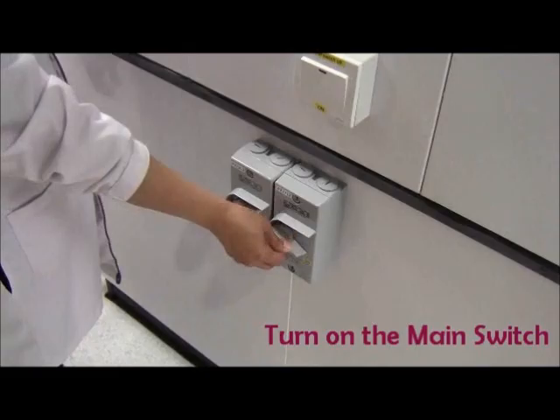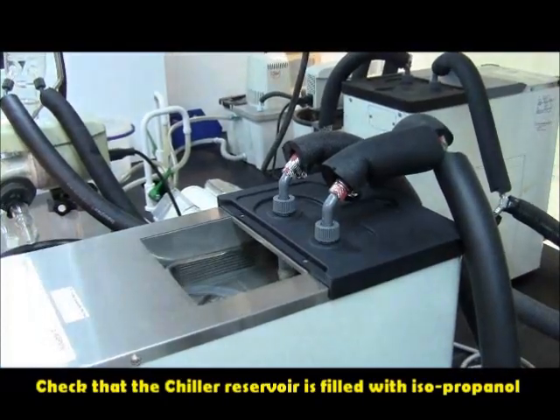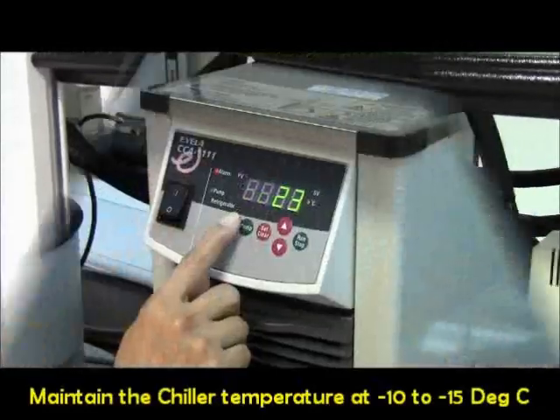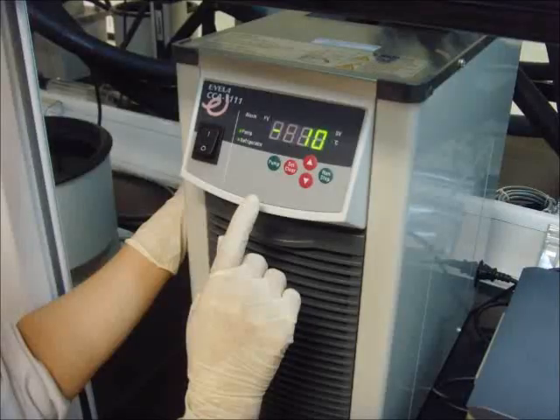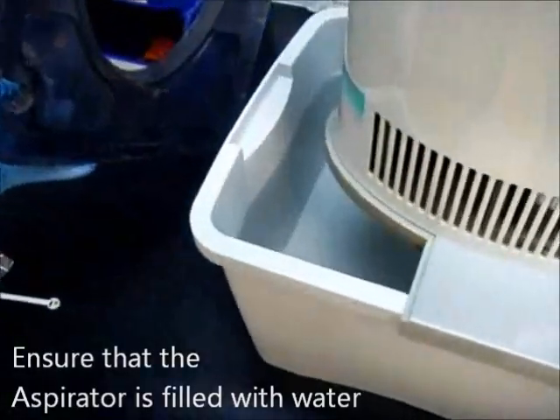Step 1: Turn on the main switch. Check that the chiller reservoir is filled with isopropanol. Switch on the chiller and maintain the chiller temperature at negative 10 to negative 15 degrees Celsius. Ensure that the aspirator is filled with water.